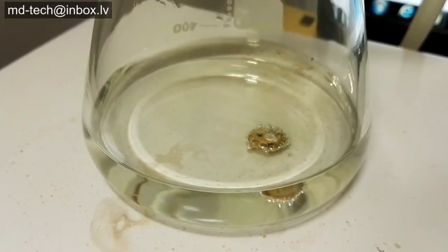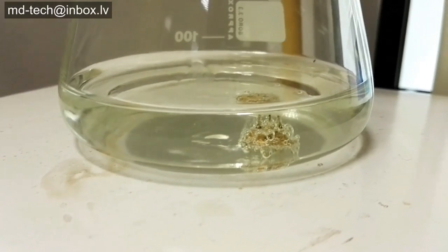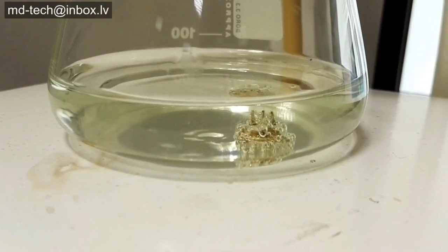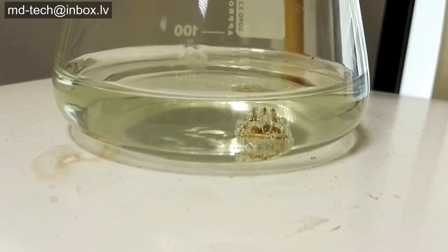Sulfuric acid and an oxidation agent, like nitric acid or hydrogen peroxide, is called piranha. Yes, it's his fish. It dissolves metals at hot or ambient temperatures.